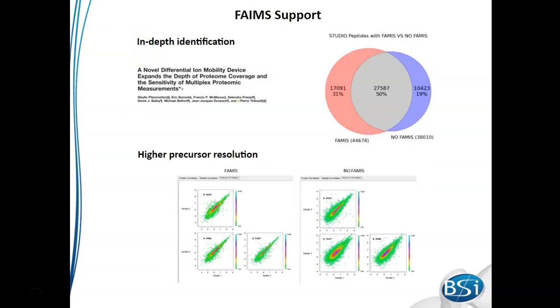Also, in this video, I'm going to go through one of our newly supported ion mobility types, which is FAMES. FAMES uses the concept of compensation voltage in order to extract different types of peptides from the mass spectrometer in order to improve separation. It's been shown in several different studies that this method is a great way to extract more different types of peptides from Orbitrap data.